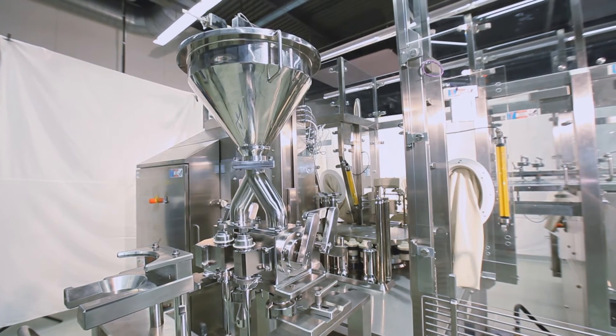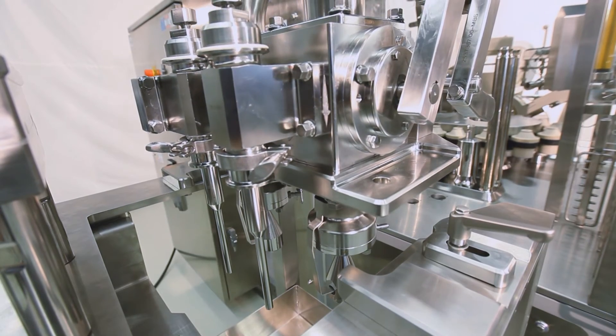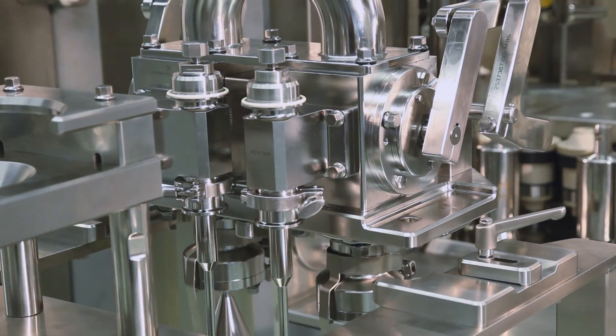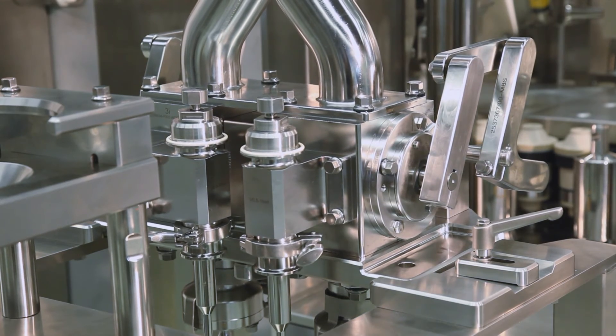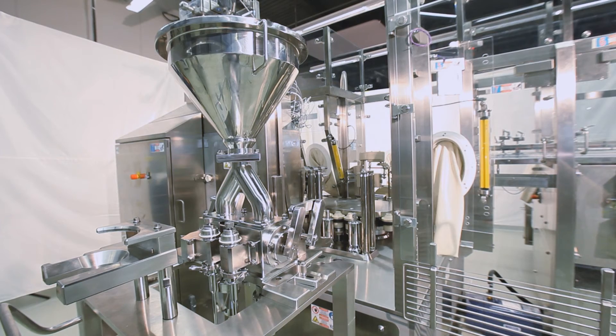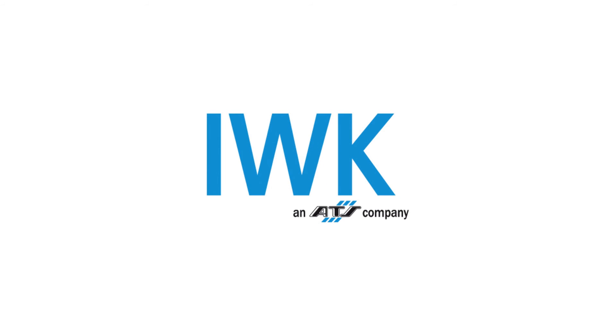The conical dosing system is designed so that it can be sterilized in place on the machine. A fully automated system for a complete clean-in-place and SIP process is also available in the IWK product portfolio. Again, an impressive tube packaging line manufactured by IWK.